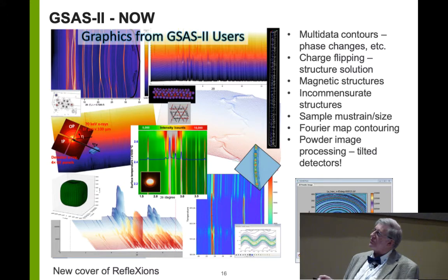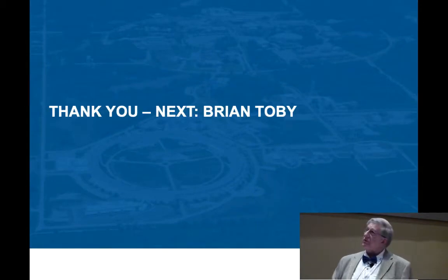All of that sort of stuff is all part of, I mean, look at this thing right here. But also featured on here are things like contouring maps, magnetic structures, image processing. This is one I added later for highly tilted detectors. And with that, I thank you.